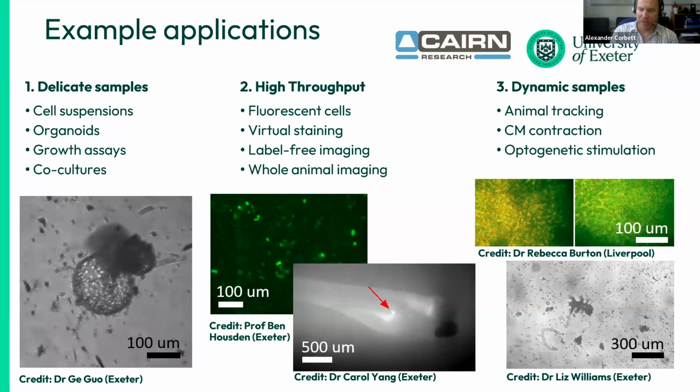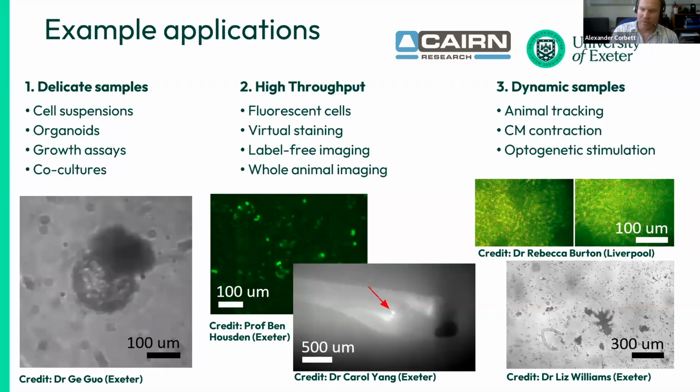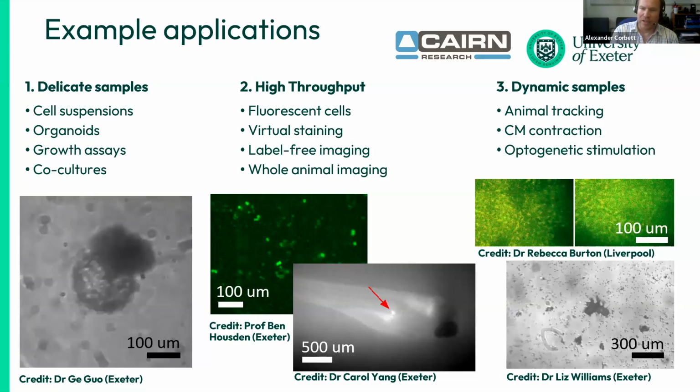And as Gil pointed out brilliantly, if you want to look at dynamic changes within a particular sample, then it's obviously very well geared up for that, whether that's tracking applications, cardiomyocyte monolayer contraction, as Gil showed, or any optogenetic stimulation.